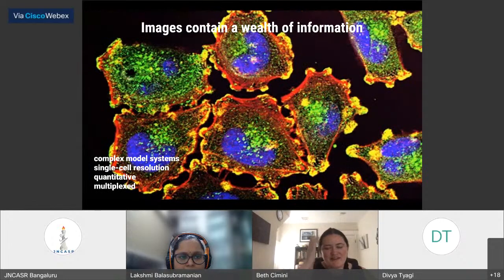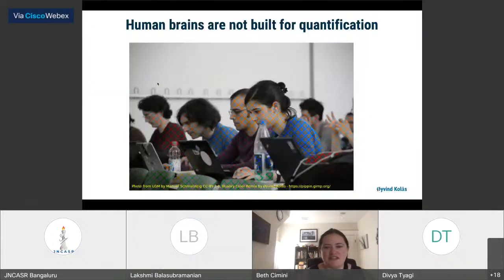So at this point, you guys have been in this course for several days now, so I probably don't have to convince you that images contain quite a lot of information and are really valuable data sources, just as much as, say, a sequencing experiment or any other kind of experiment. The fact that they can be quantitative and multiplexed is really valuable. But in terms of computational analysis of images, there's one aspect that I think a lot of times people overlook, which is just that even if it's something where you think you can count something by hand, human brains are in fact quite terrible at quantification.